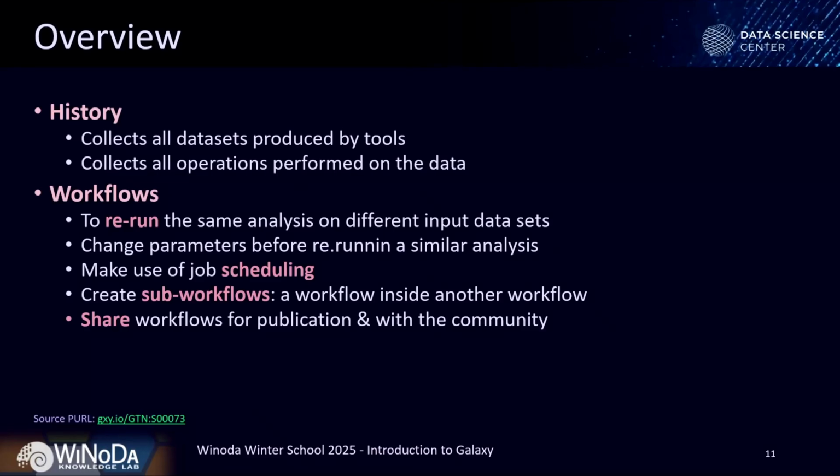Therefore, we will make use of the job scheduling with these workflows. All the jobs in your workflow will be scheduled just by pushing the run button. For example, if the analysis will take maybe 2 days, depending on your data set and what you do, you can just click on the button that you want to have a notification on your email, and then you can come back in 2 days for your ready analyzed data sets.